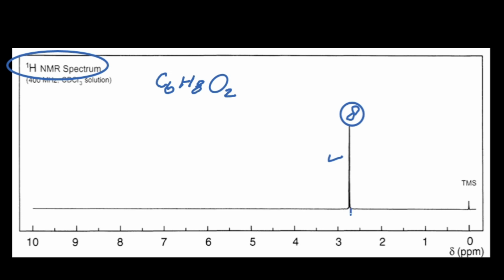And now it's time for the chemical shift value. As you may see here, the chemical shift value is almost 2.7 ppm. This ppm value tells us that your hydrogens may be attached to a carbon that is present in the vicinity of the carbonyl group. So first of all, the CH2 groups are present, and second, the carbonyl groups are present, and the chemical shift value also tells you that your hydrogen is present in the vicinity of the carbonyl group.